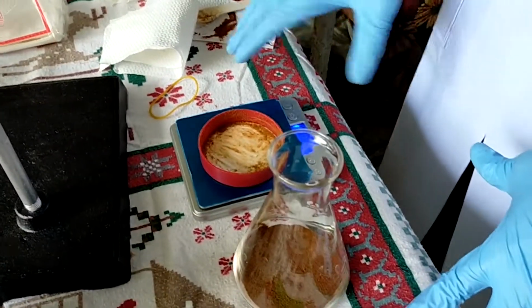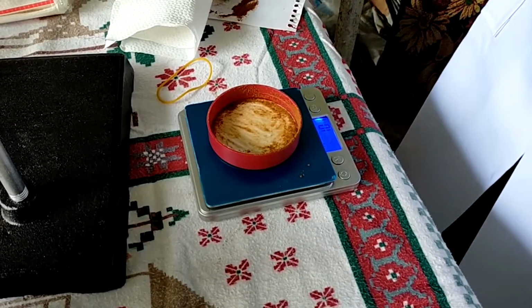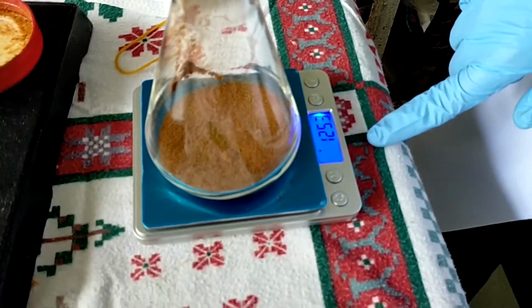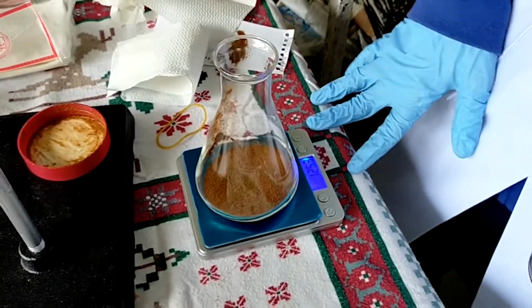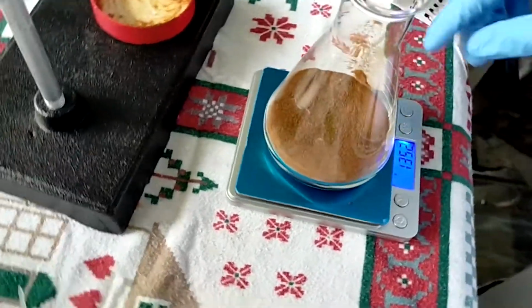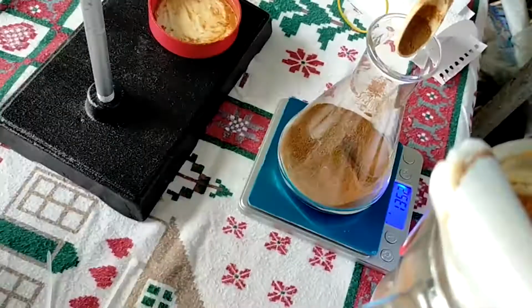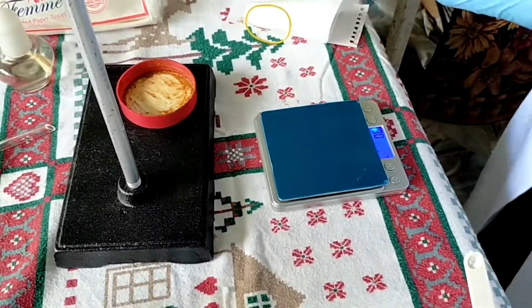Okay, now the weight of my cup is at 10.1 grams, so I still need to put 10 more grams of coffee in this funnel right here, in this flask right here. Okay, now since my flask weighs at 125.3 and our required is at 135, 15 grams of coffee, I would still need to put 10 grams of coffee here in my flask. Okay, now that my flask weighs at 135.2, we'll just put some more. 5.4, I'll just remove some. Okay. Now that it measures 135.3, this is the 15 grams of coffee that I will need.